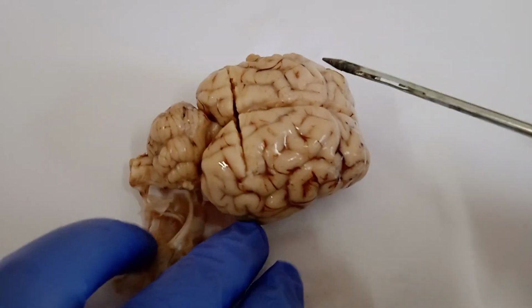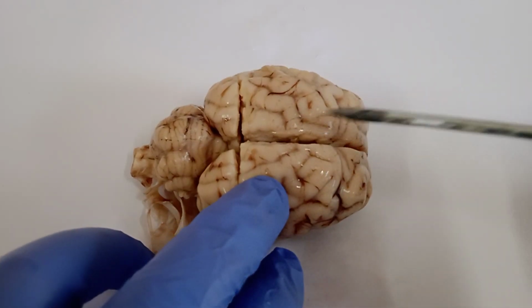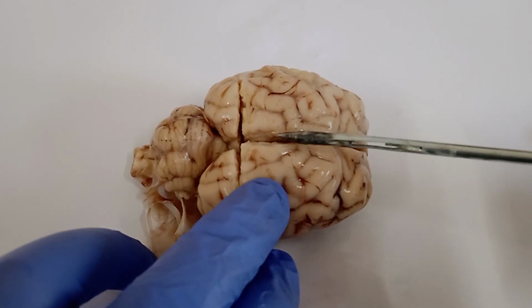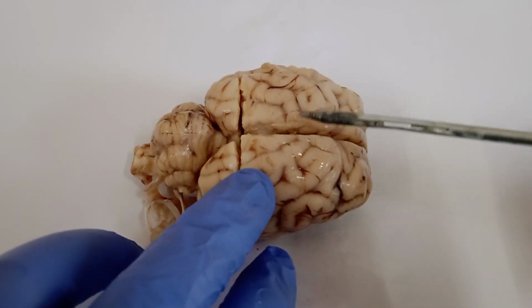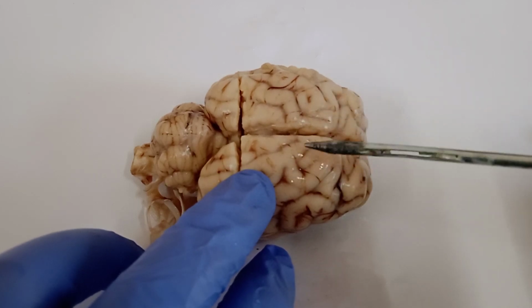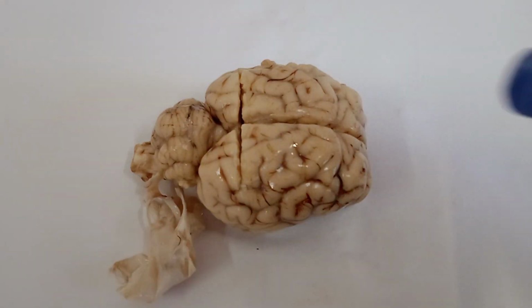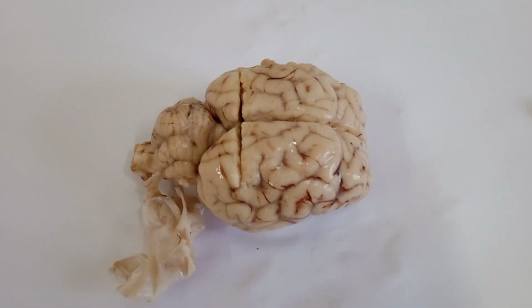And this cerebrum basically has two parts, divided by this longitudinal fissure, because a fold of dura mater will be fixed here, which is called the falx cerebri. As a result there will be two divisions of this cerebrum as cerebral hemispheres. One will be the right and one will be the left cerebral hemisphere. So let us cut along this longitudinal groove and see what are the features inside of the brain.